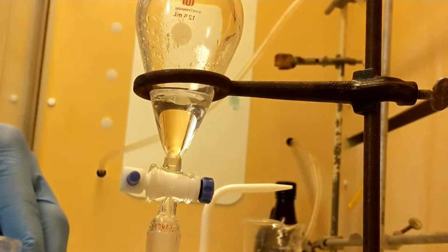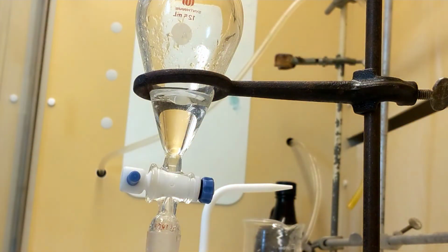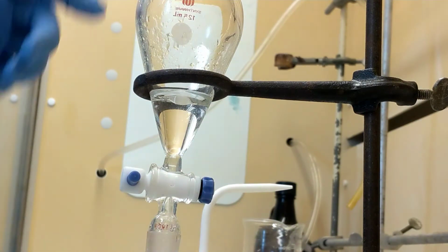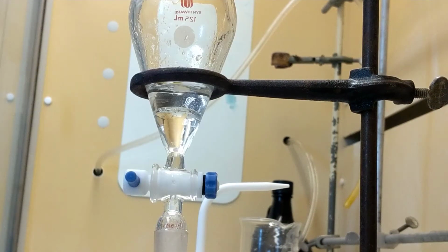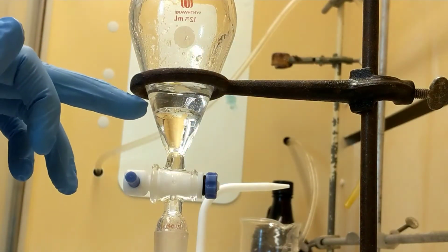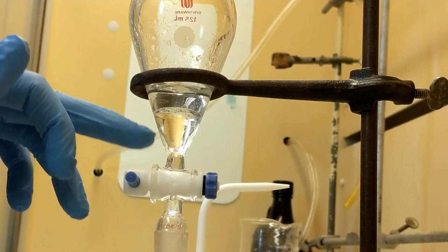I'm going to go one more time. So I'm just going to add 5 milliliters of methylene chloride back into the top, shake it up again, pull out the bottom one more time. Alright, this is the third extraction, my last one. So in this one I'm going to do the exact same thing, except I'm going to make sure I get every drop of the organic out.